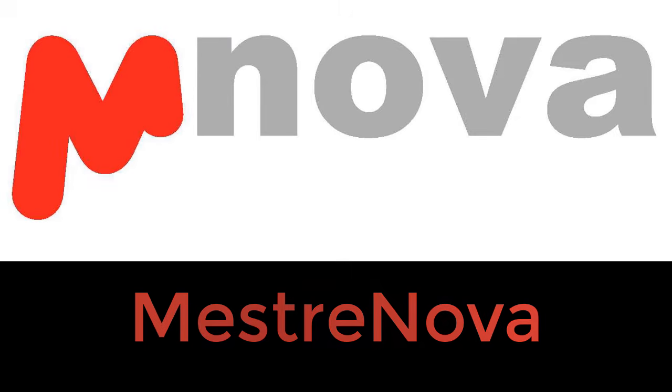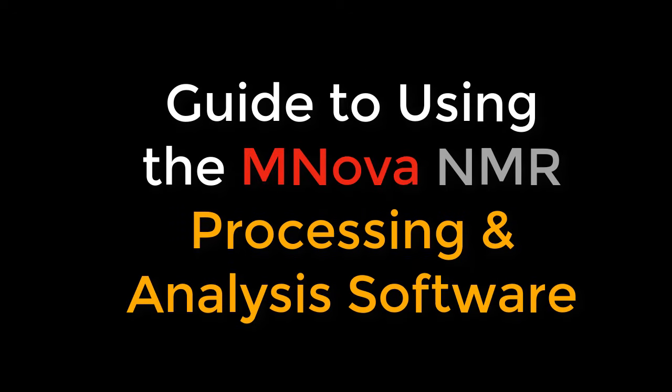Hi guys, I'm Funman, and today I'm demonstrating a quick guide on the use of MestreNova, the NMR analysis software that you will use in the lab.